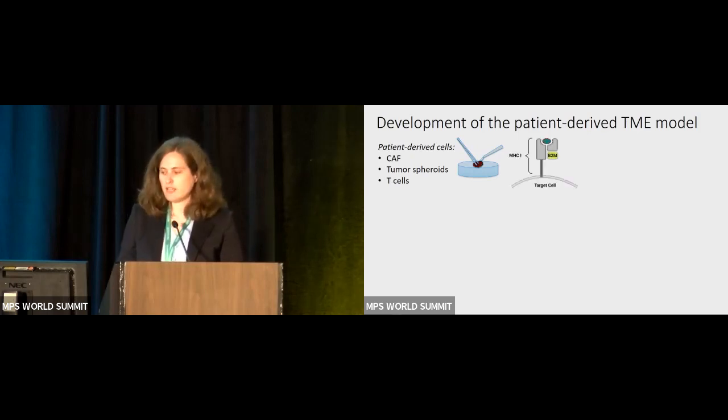But we took a different approach, and we were looking at trying to make the endothelial cells invisible to the T cells. So T cell recognition is the T cell receptor binding to the MHC peptide complex on the target cell, and the MHC class 1 has one fundamental building block, which is the beta-2 microglobulin, or the B2M protein. And so we knocked that out in our HUVEC cells in order to make HUVEC that would be invisible to these CD8 T cells.